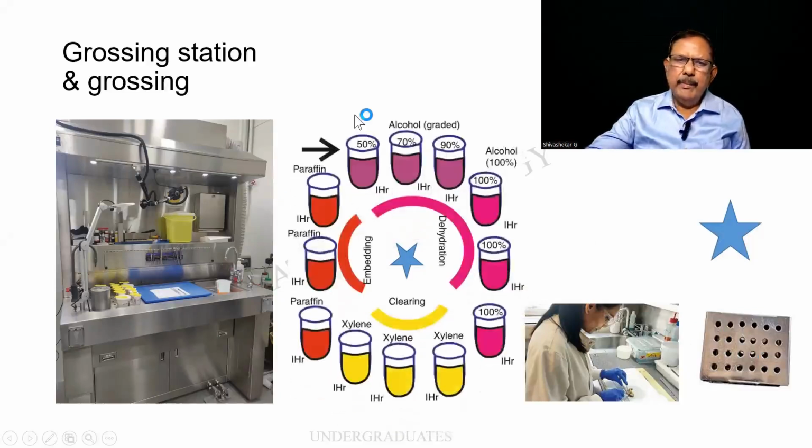This is extremely important. What are the stages? Now what happens is you people have sent it in formalin and we also put it in formalin initially. After that, there is an ascending grade of alcohol, 50, 70, 90, 100%. Gradual grading so that there is not much contraction of the tissue. Then the alcohol has to be cleared.